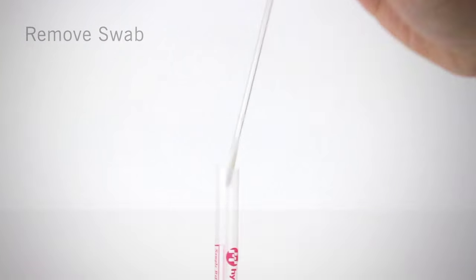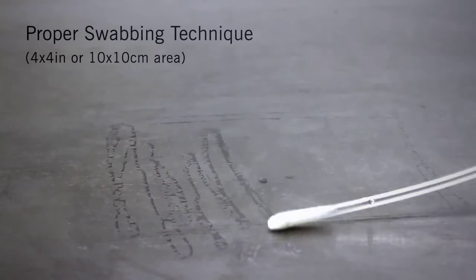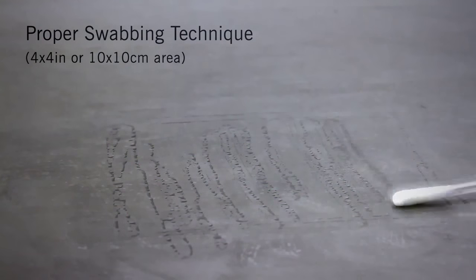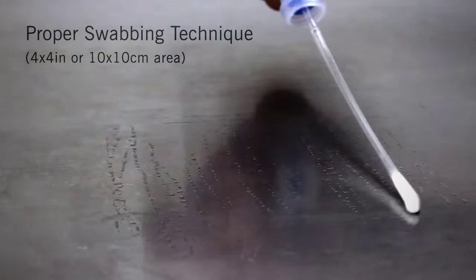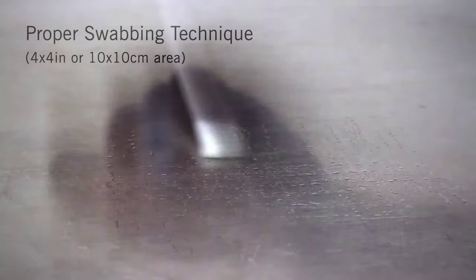Remove the swab from the tube. Swab a 4x4 inch or 10x10 cm square area in a criss-cross pattern, swabbing the area with even coverage.